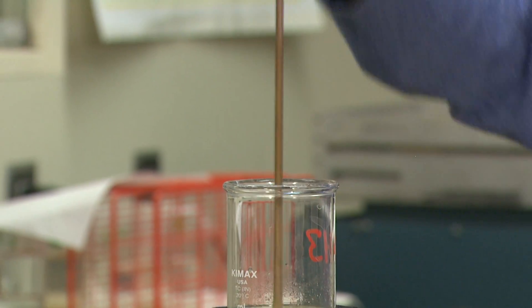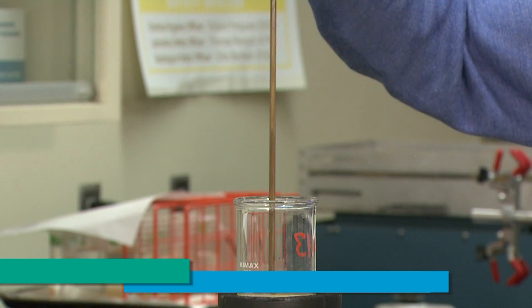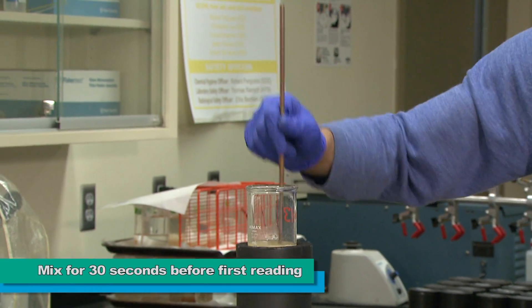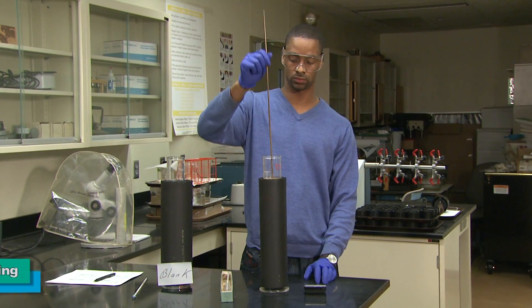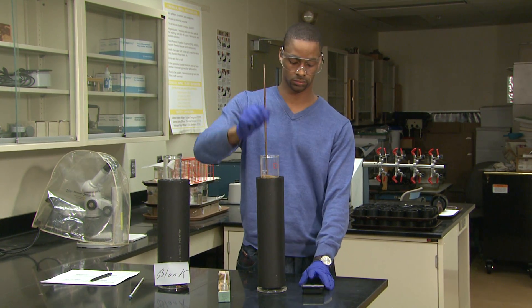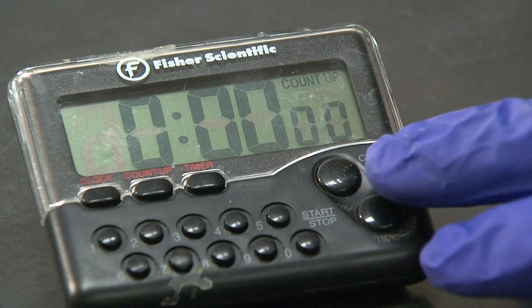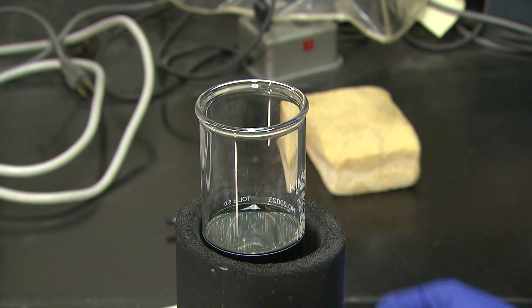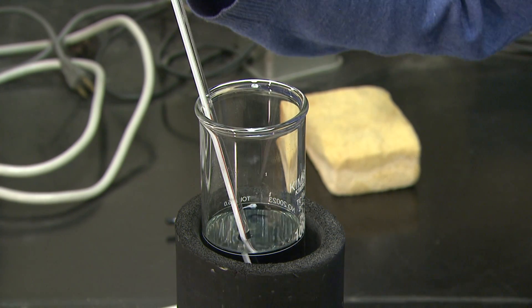Just prior to initiating the series of hydrometer readings, the solutions in the cylinder should be thoroughly mixed for 30 seconds to ensure a homogenous character. The instant the 30 second plunging has been completed — that is when the plunger is removed from the solution on its final upward stroke — a timer should be started and the time recorded on the data sheet. Readings of the blank cylinder must also be taken at the same time intervals; manage your time so that you can take both blank and soil solution readings together.